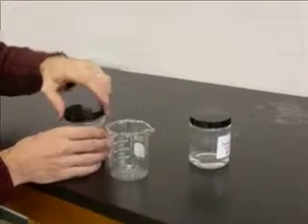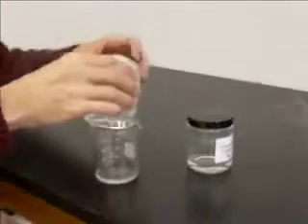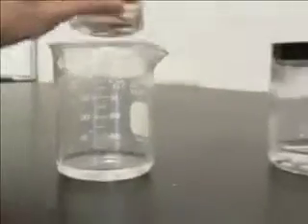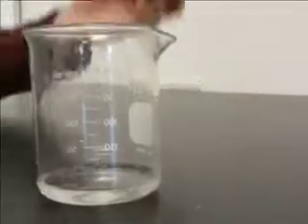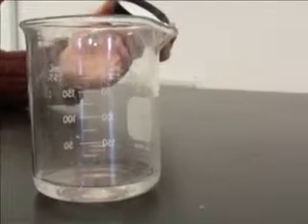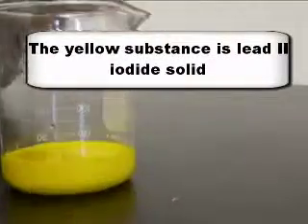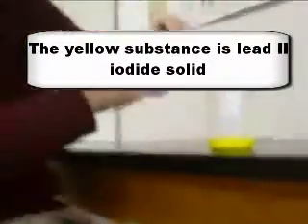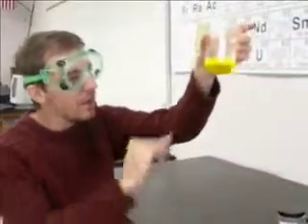So what I'm going to do is add a little bit of lead nitrate to my beaker. And then I'm going to add some potassium iodide to my beaker, and whoa! Our two clear and colorless liquids formed a yellow solid. If you get real close here, you can see that it's a solid that's formed.